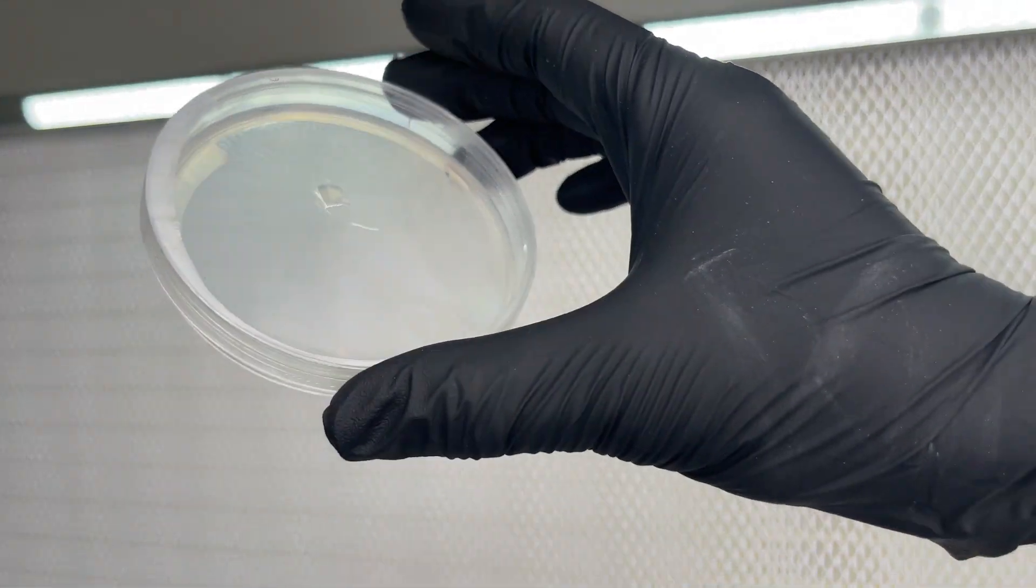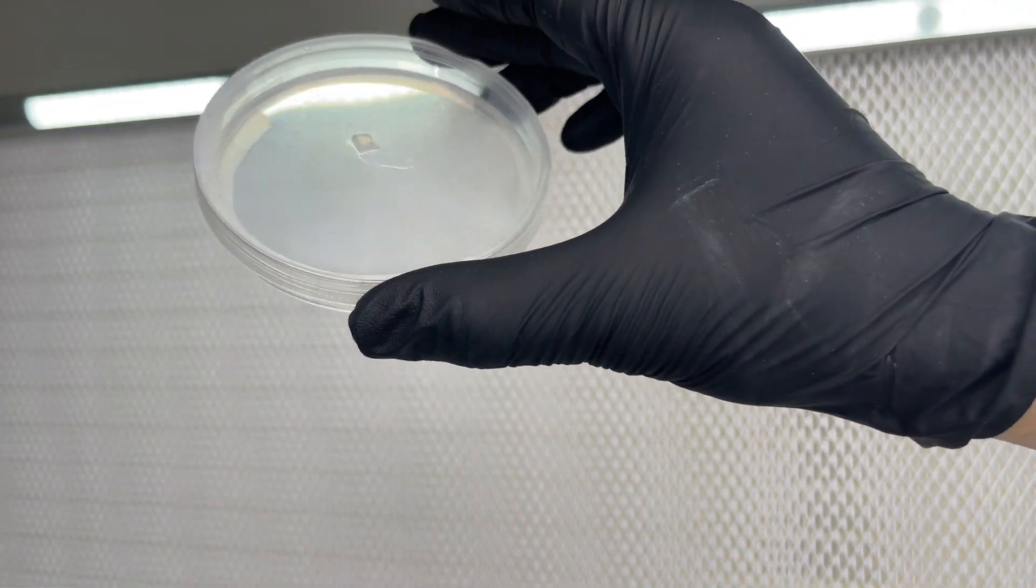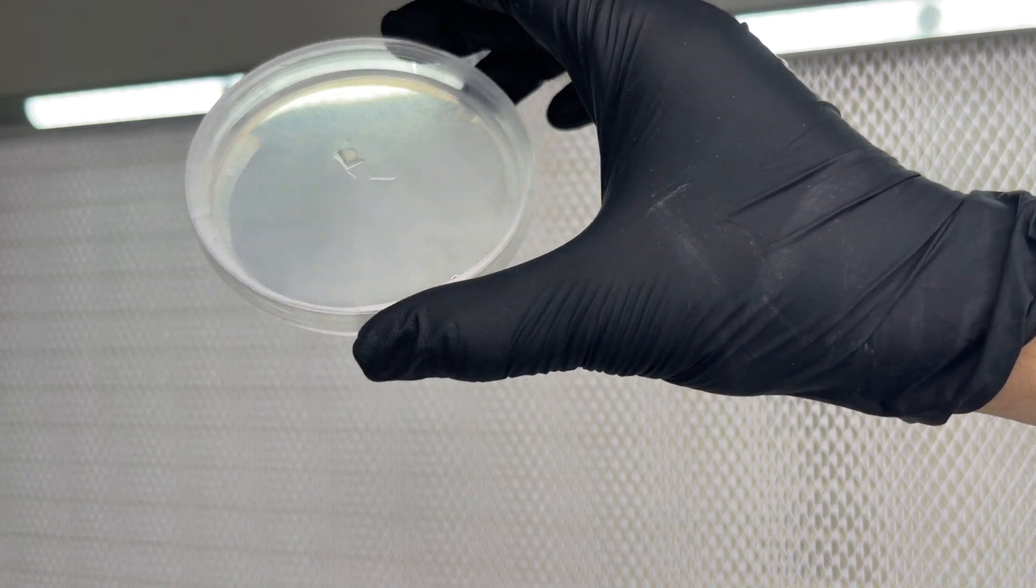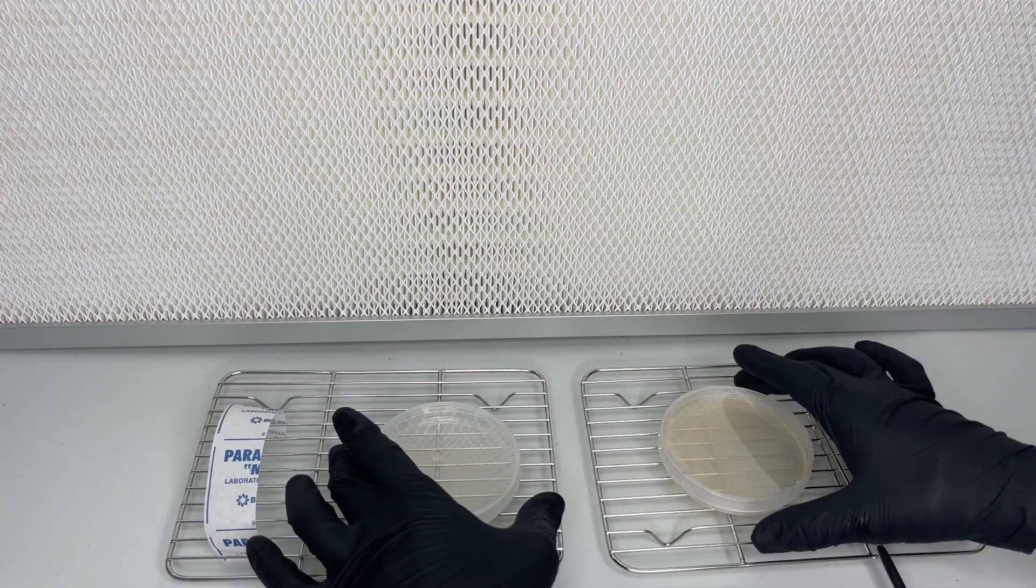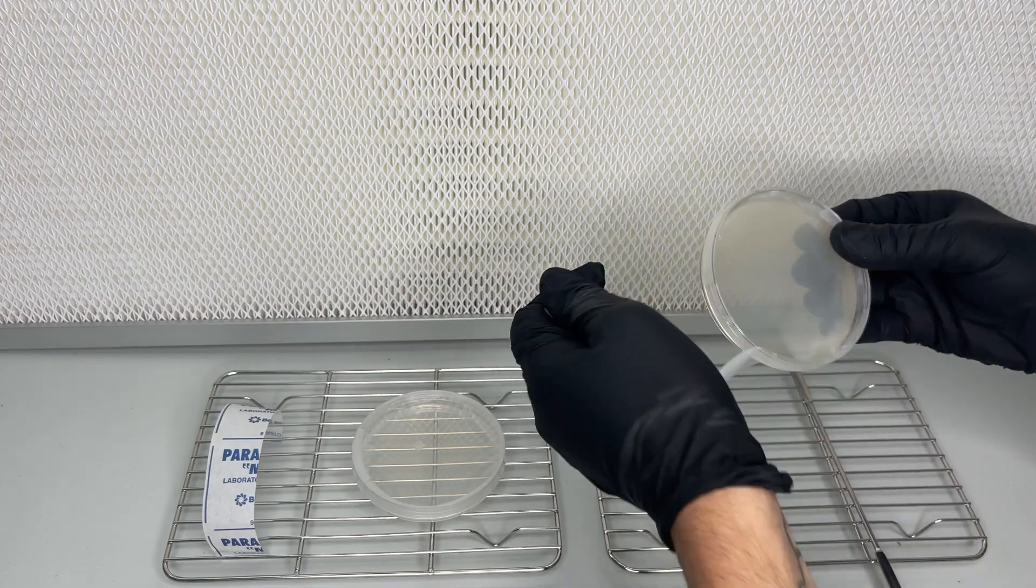After about one week of growing, you can see the thin mycelium on the water agar plate. We can no longer see any orange bacteria, so that's a good sign.